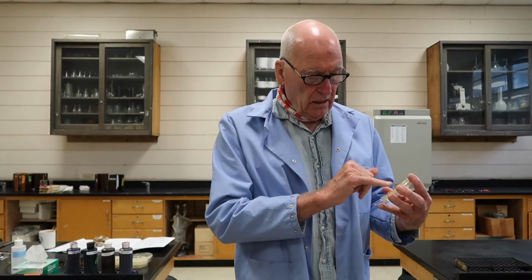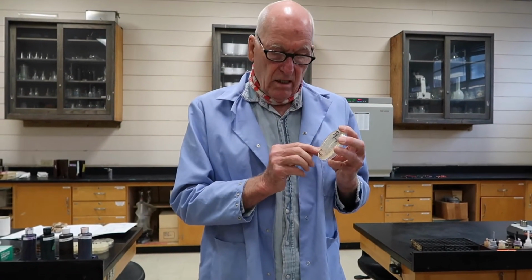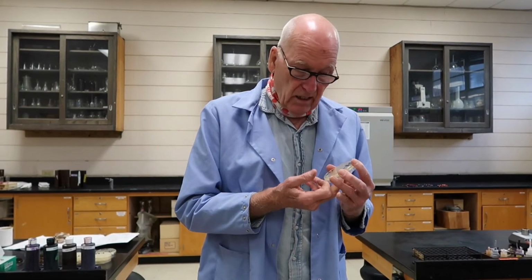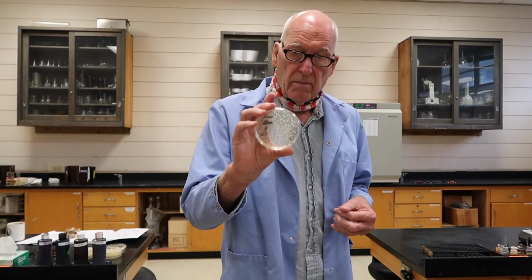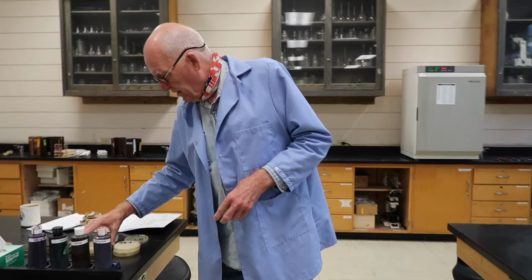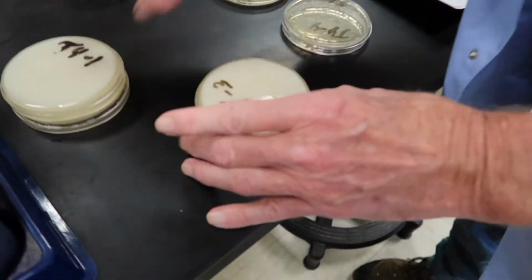This one is a -4 dilution, and it's on growth media here, tomato juice agar. You don't have a lot of sucrose in this, but you can see they're building the typical colony from this.